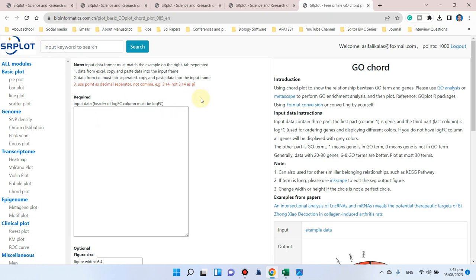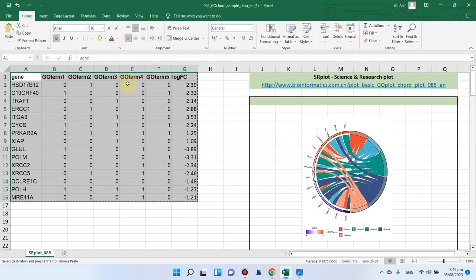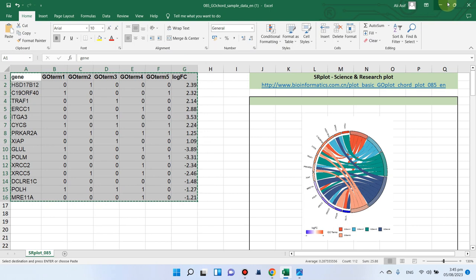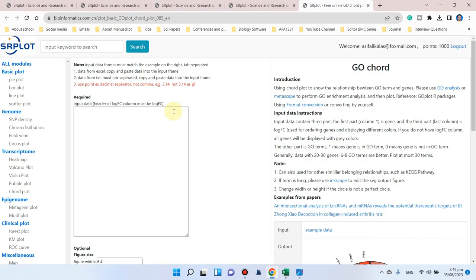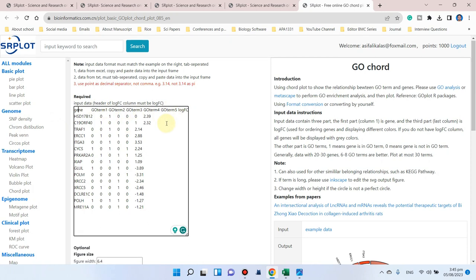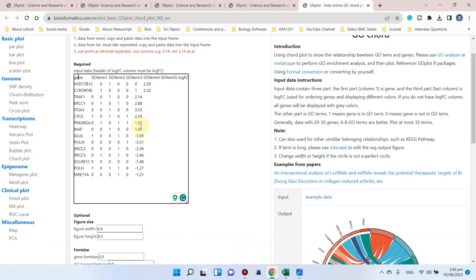When you click on this, this window will open and here you can design your GO chord plot. Here we can input our data. In this example we have just copied that - we can copy this all. The first column is gene, the next ones are the GO term IDs, and the last one is the log FC value.